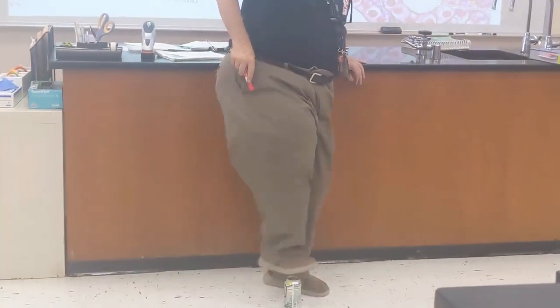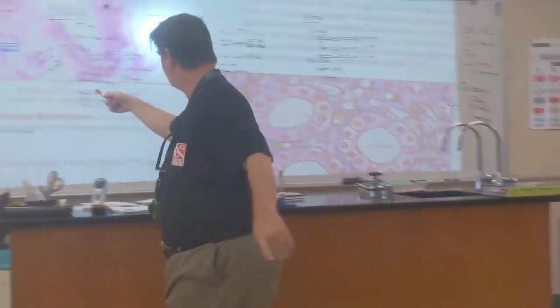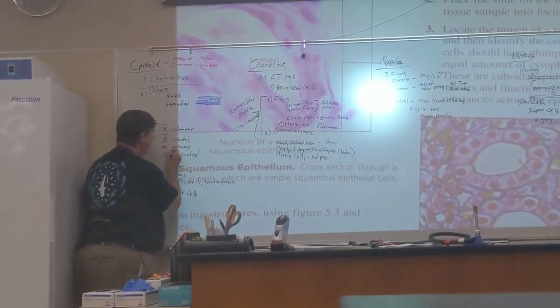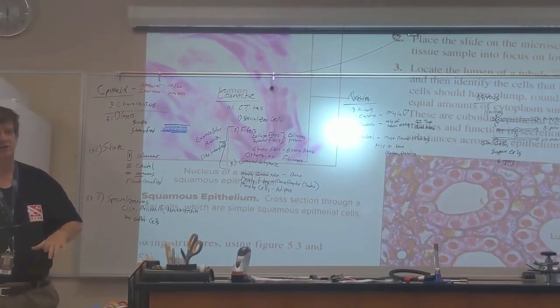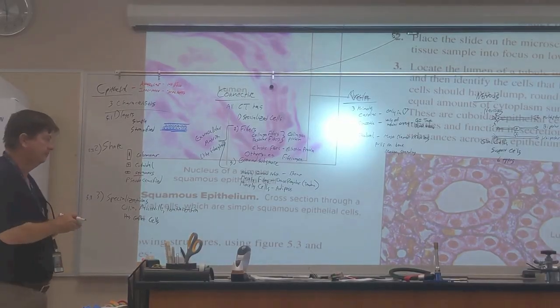So this can be squashed flat. Do we agree? That cell is squashed flat. The SQUA in squamous should remind you of the word squashed, because that cell is squashed flat. Very, very flat. All right?